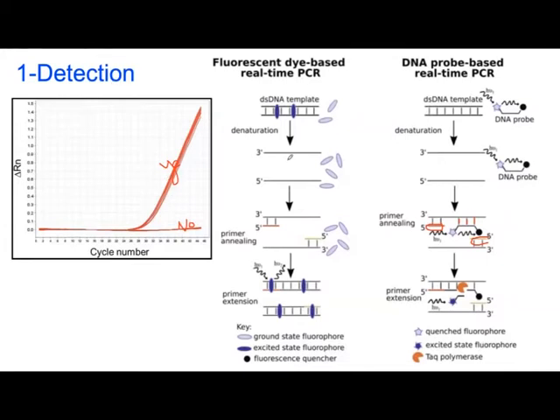Now let me give you one example, so try to understand what I'm trying to say here. Suppose that you have a sample from the field. It could be a plant with a disease or a patient with a disease. And from this sample, you want to see whether you're going to get the whole DNA, and then there is DNA of that specific bacteria.